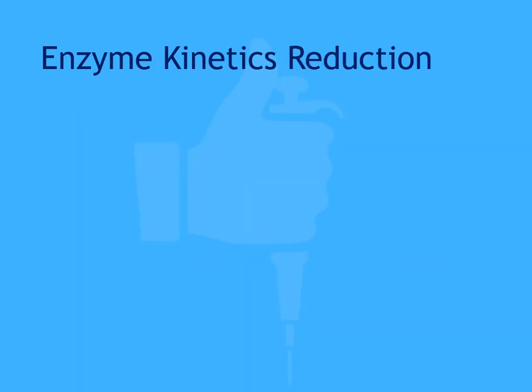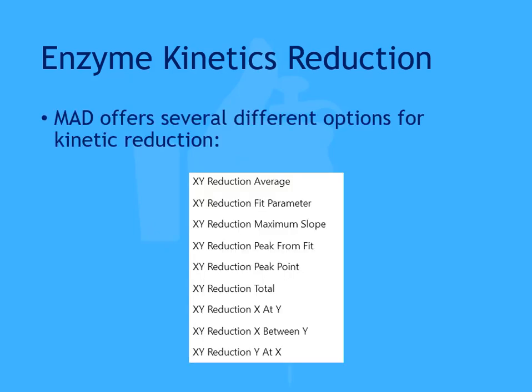The available XY reduction transforms in My Assays Desktop are XY reduction average, fit parameter, maximum slope, peak from fit, peak point, total, x at y, x between y, and y at x.